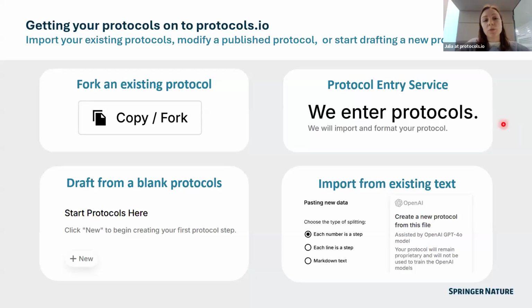And then we do also have an AI-assisted protocol importer. So if you have a protocol that is in Word or PDF or really many other formats already, what you can do is upload that and we will convert it into the dynamic stepwise format on protocols.io.